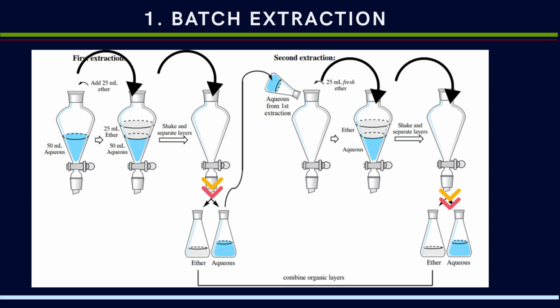Here, we can see how batch extraction can be performed using a separatory funnel, shown in the image. The extraction of organic and inorganic components from aqueous solution of soil or food, etc., is done many times until the maximum extraction or separation of the target substance from the solution.